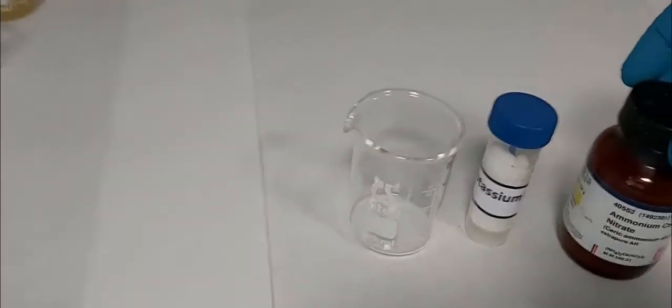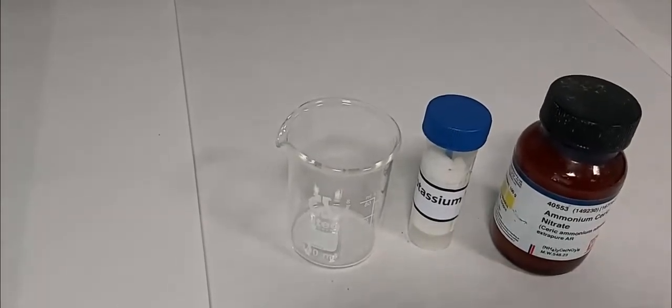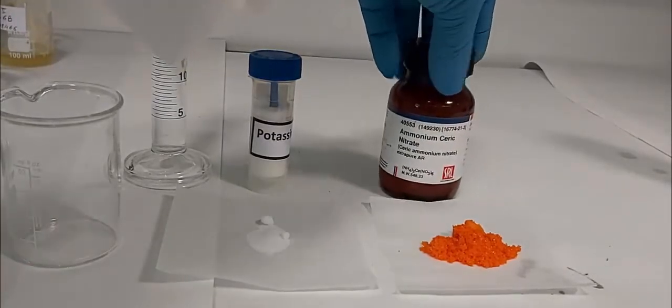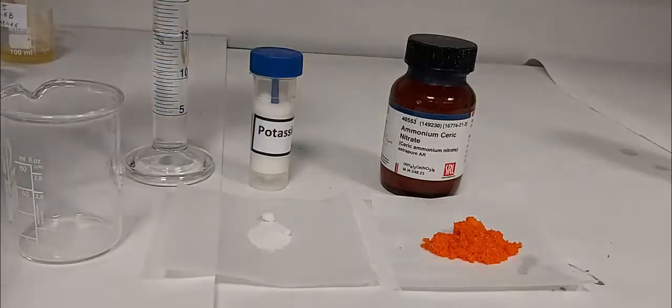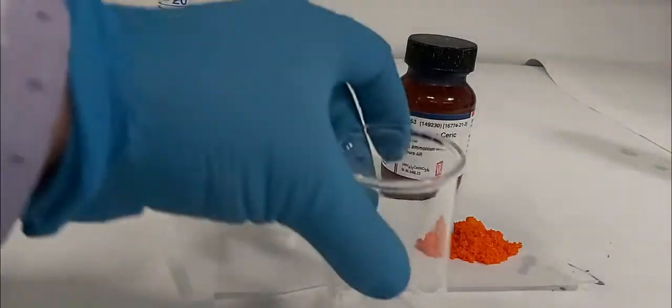In a separate beaker, we weigh one gram of potassium bromide and six grams of ammonium ceric nitrate, then add 15 ml of water. So here I have six grams of ammonium ceric nitrate, one gram of potassium bromide, and 15 ml of water.